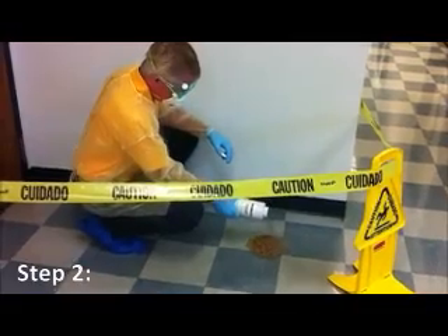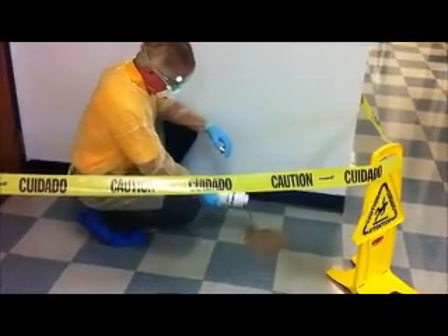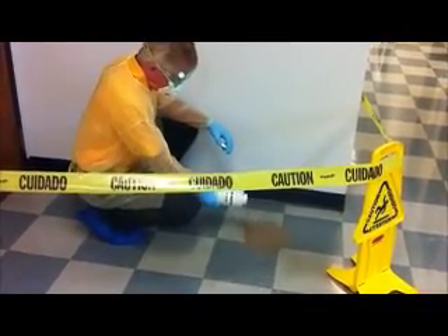Step 2. Apply absorb directly to the area, making sure to cover the entire area, allowing it to soak up the fluids.